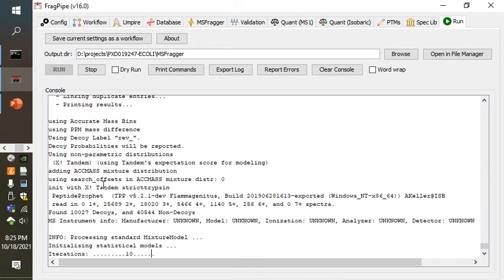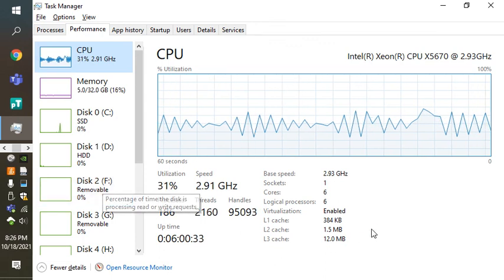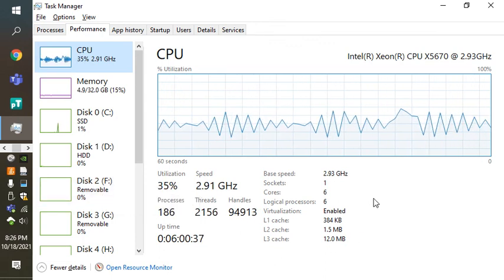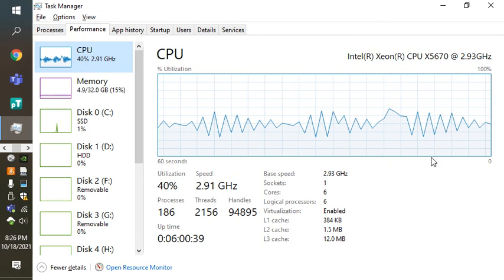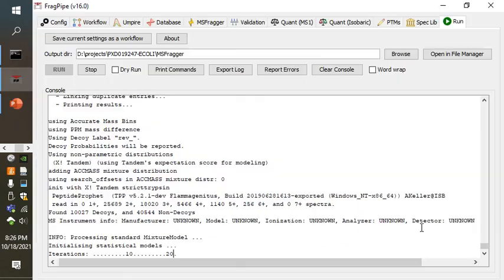All right. I did mention that the database search of MSFragger does not necessarily consume the most time in this pipeline, and here you can see that PeptideProphet is, in fact, consuming a fair bit. It's also the case that this is another case where your CPU is going to get a pretty fair beating. Here we're using between a third and half of the CPU cores to keep up with working through these complex data structures.